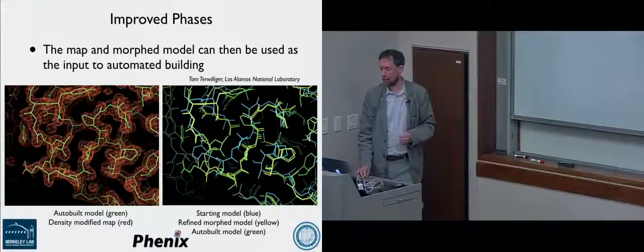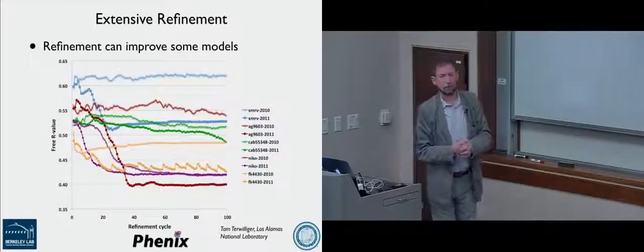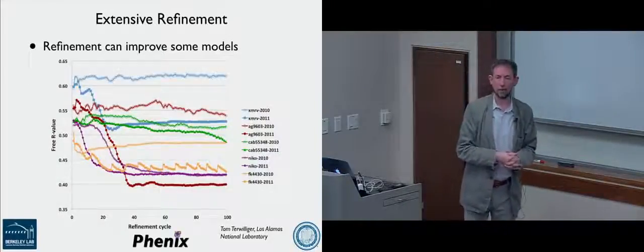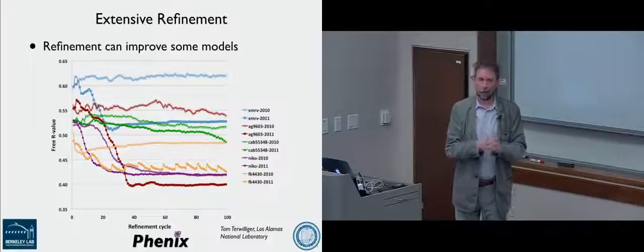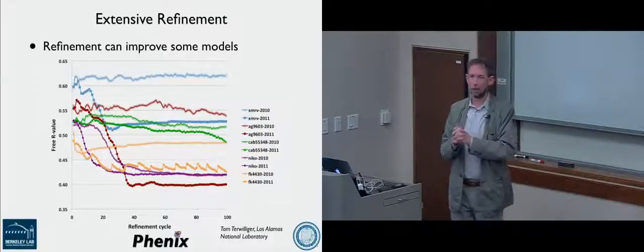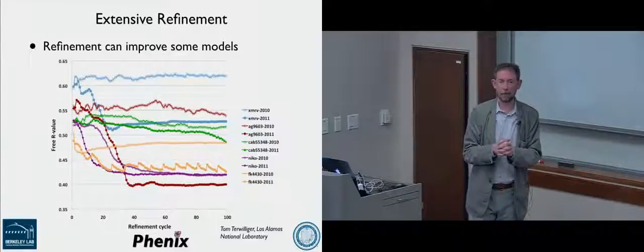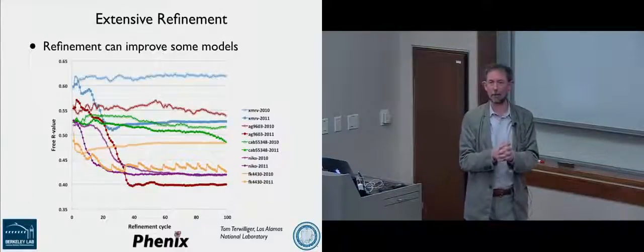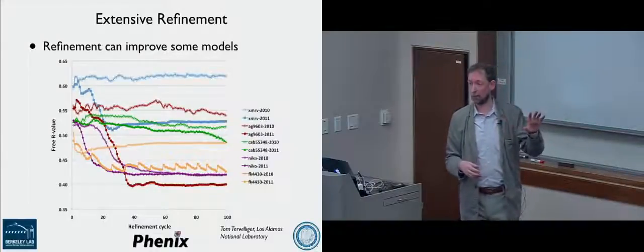So you can see we've had very substantial shifts in atoms here, in secondary structure elements. This process is called morphing, and it is a bit computationally more efficient than the MR Rosetta approach. There are some things that MR Rosetta can solve that morphing can't. So there are a few test cases where you really need something like MR Rosetta, but a lot of the things you can do with morphing.